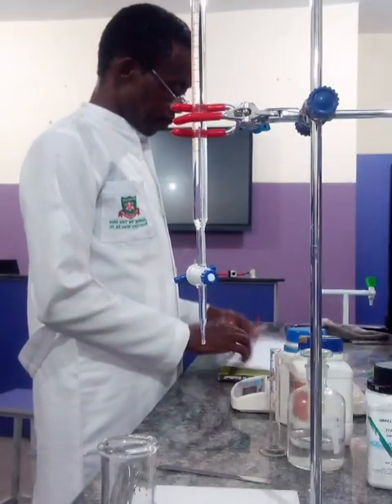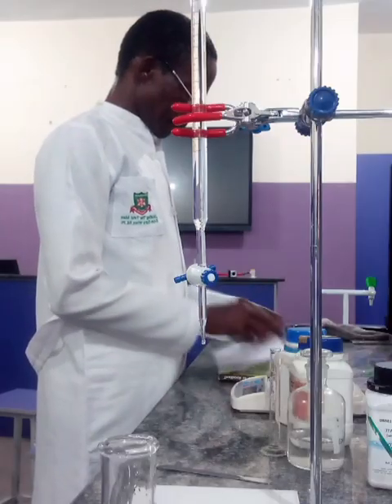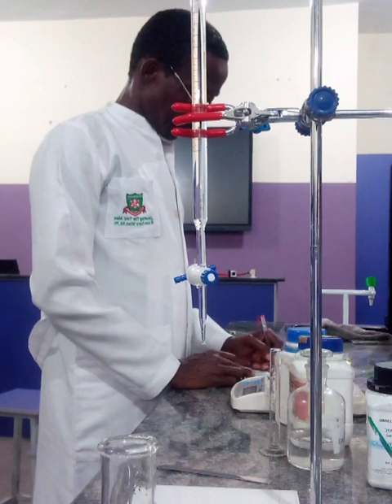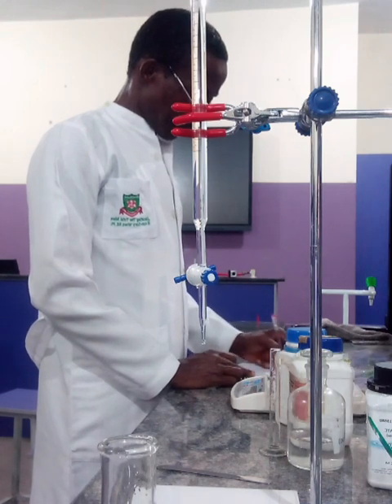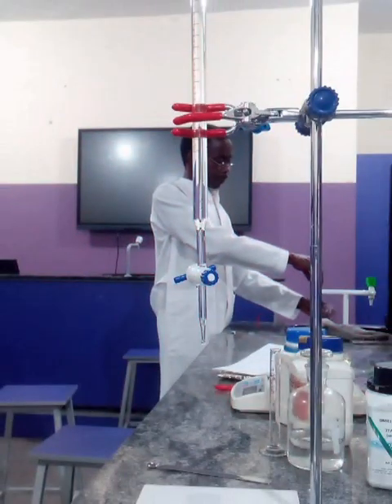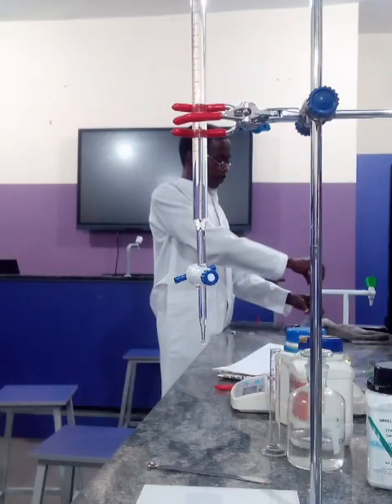So you add about 10 cm cube of the standard hydrochloric acid solution to a measured volume of the bleach.